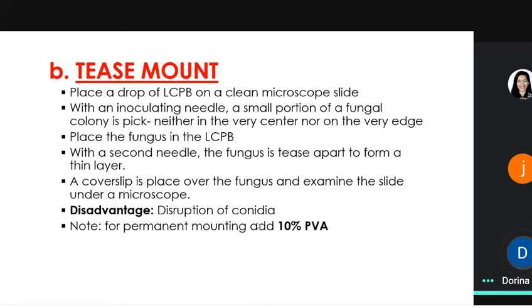So, if you would like to prepare that, kasi kung nag-lab tayo, pinag-grow ko kayo ng fungi, nag-expose lang kayo ng SDA, may tumubo, ginawa nyo ng wet mount, then pwede nyo lagyan ng PVA, and then you seal the sides ng ating cover slip with colorless na nail polish. Then that's considered already your permanent mount. Pwede mo na siyang tignan ulit, pwede mo siyang i-preserve. I mean, pwede siyang gamitin for future use. Parang ganun. Okay?